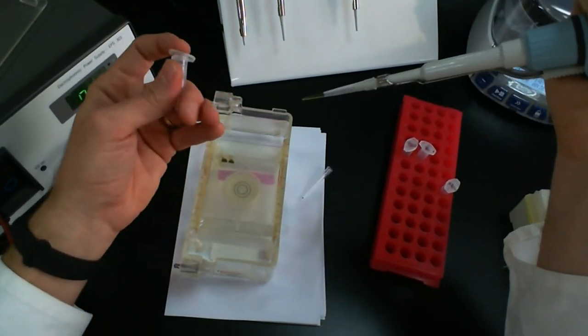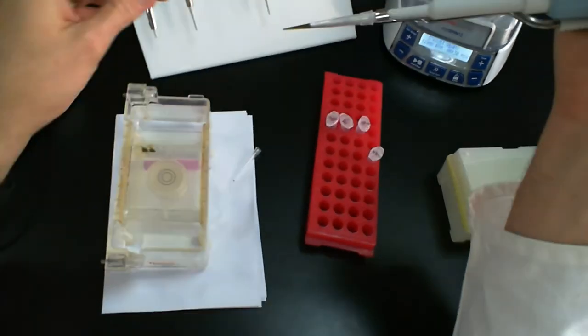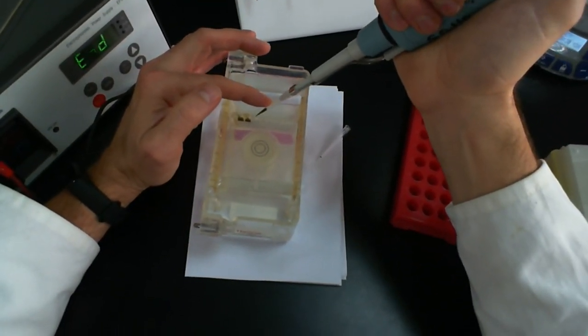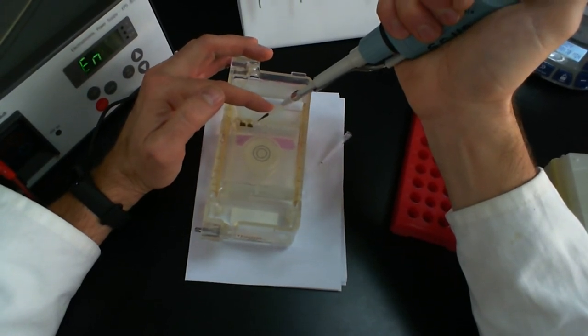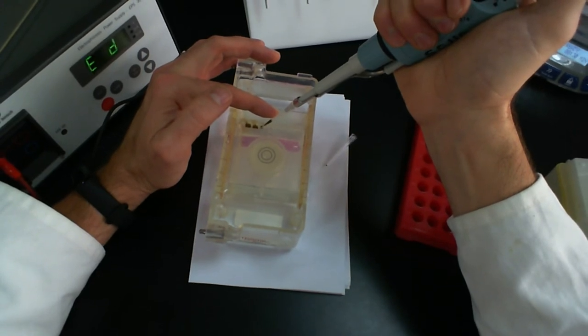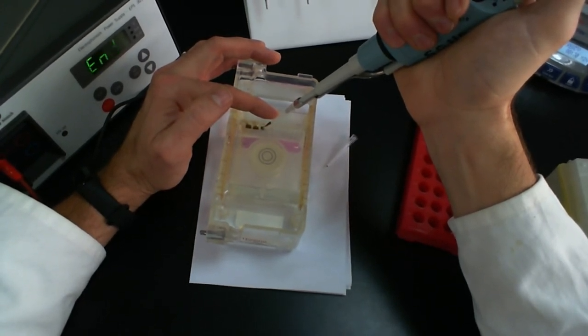This is a bit more viscous because the loading dye tends to contain glycerol, which is what makes it more heavy, more dense. And again, use your finger to help guide your tip into the well, just above the top of the well. Slowly release the contents.